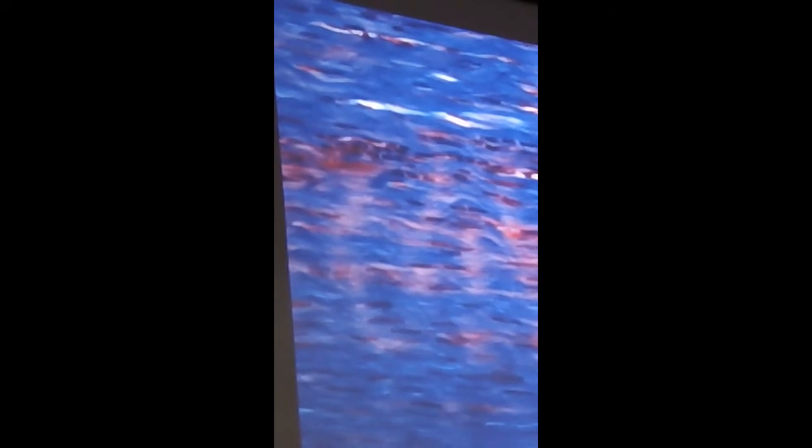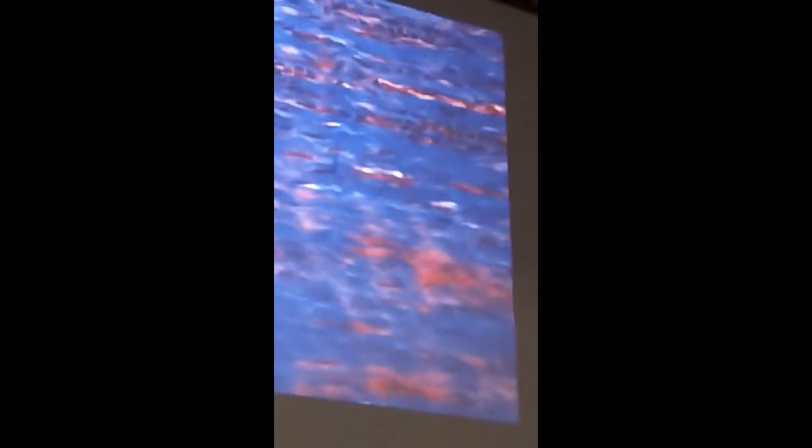Another way is to cut your aperture diaphragm down. The collagen fibers are refractive. It appears as wavy, yellowish lines, right? Smooth muscle doesn't have that refractive property. So keep in mind that that aperture diaphragm, the substage thing, is useful for trying to figure out whether you're looking at collagen or, for that matter, elastic lamellae in the aorta. Same song, second verse.